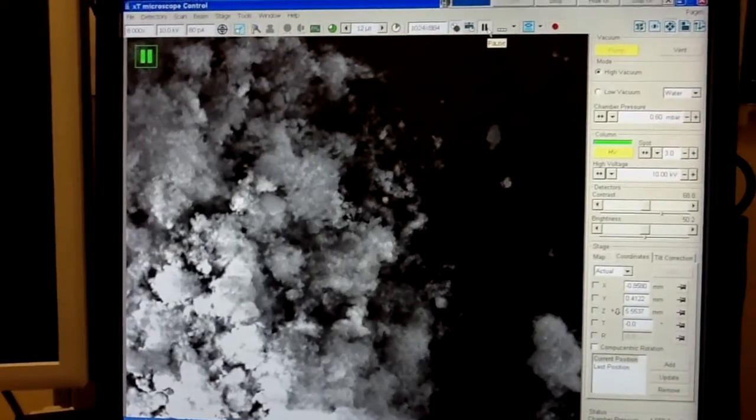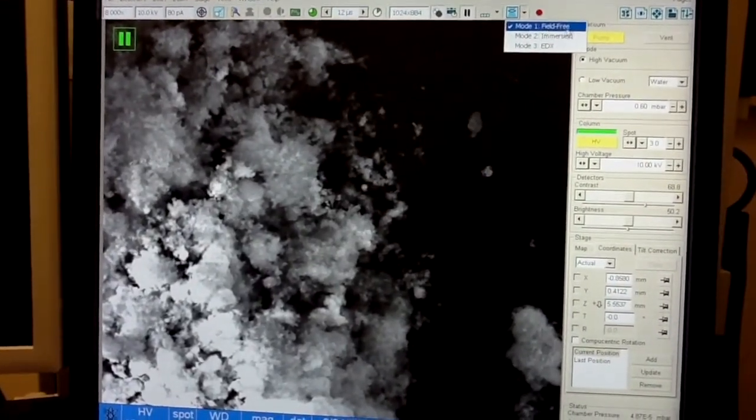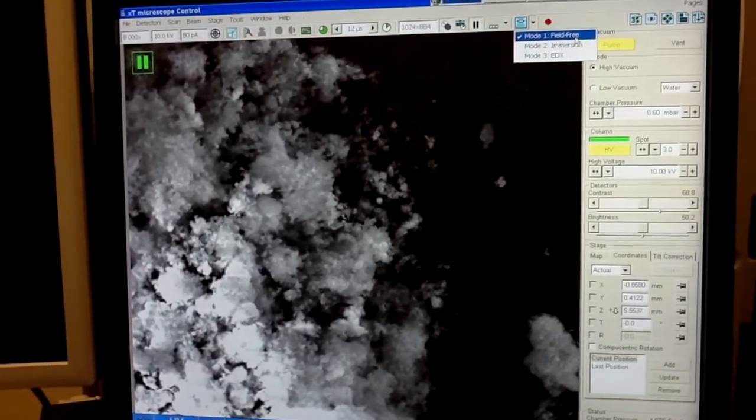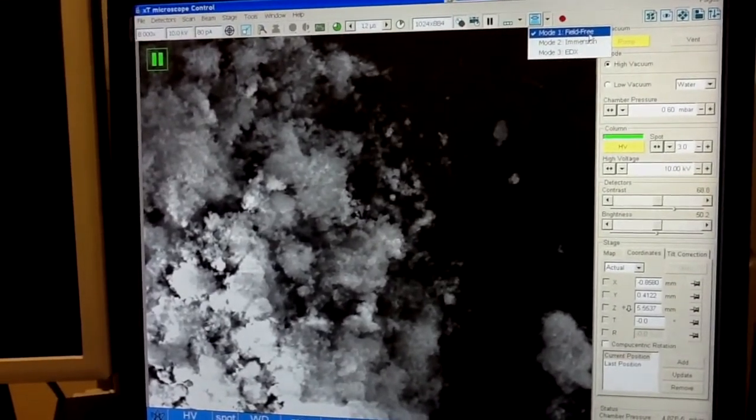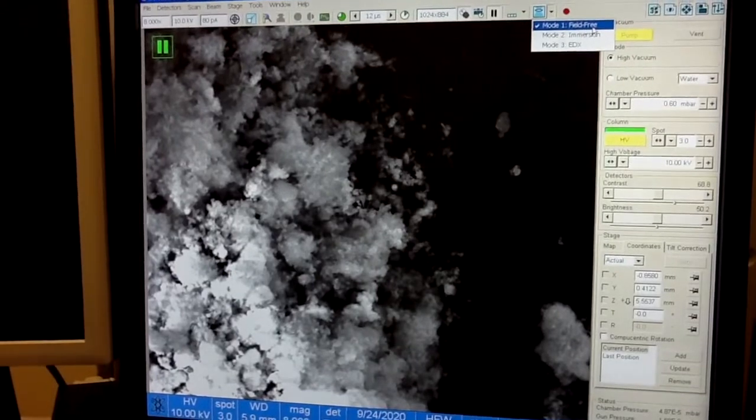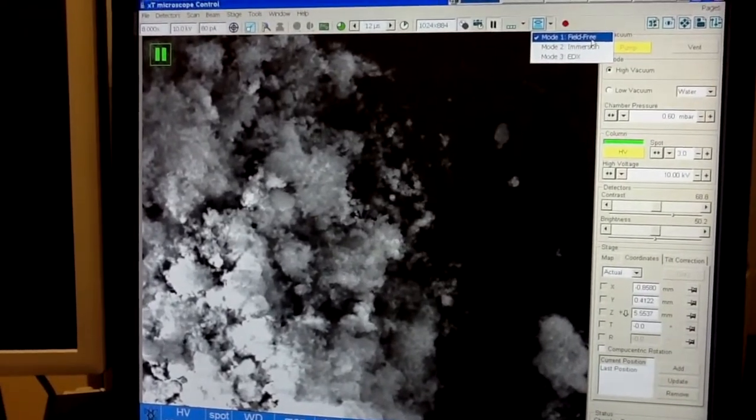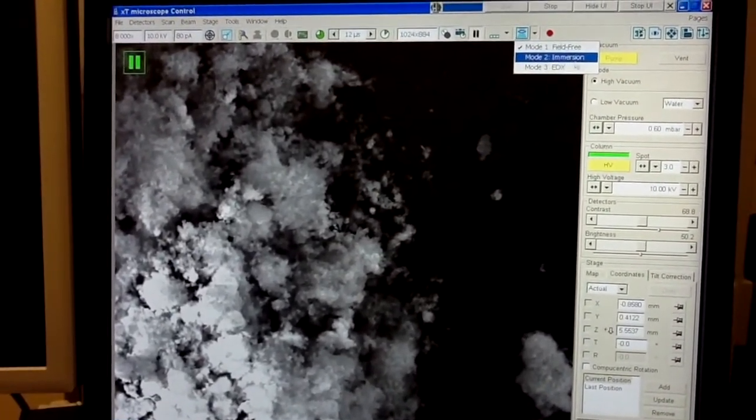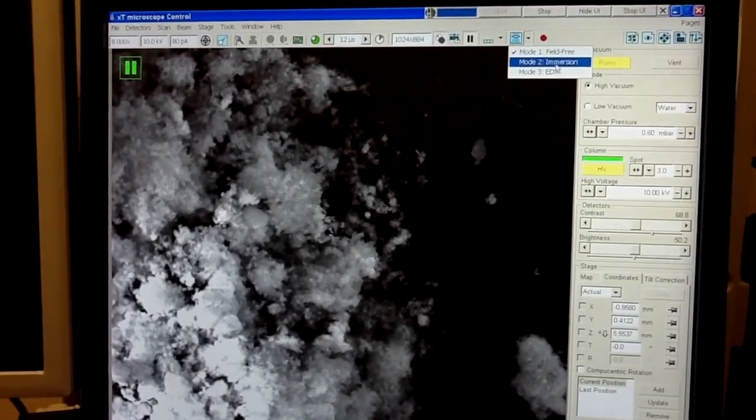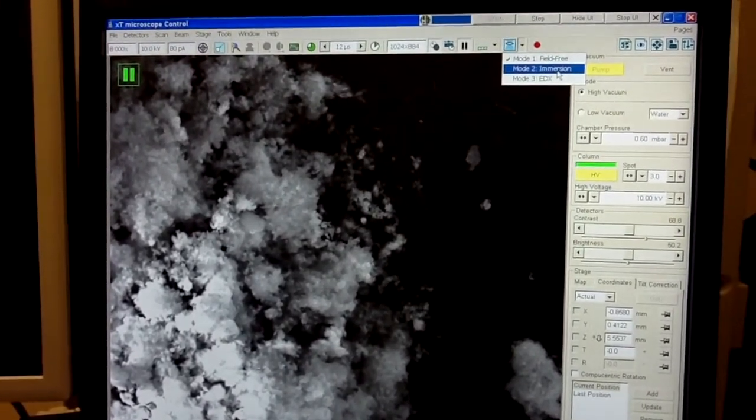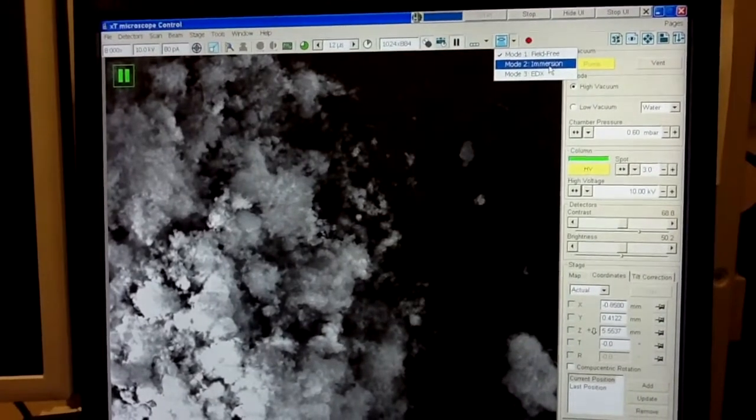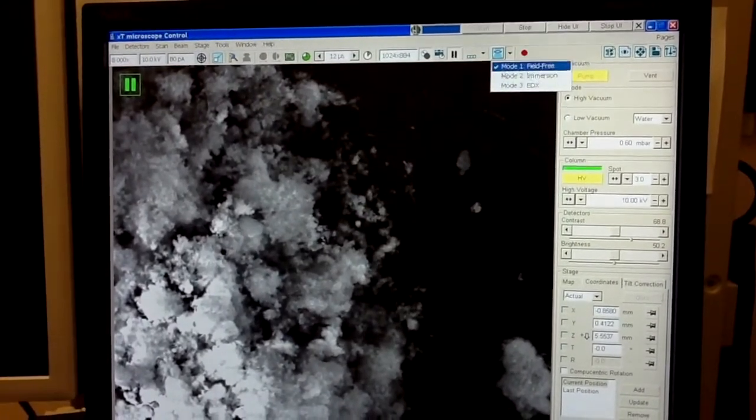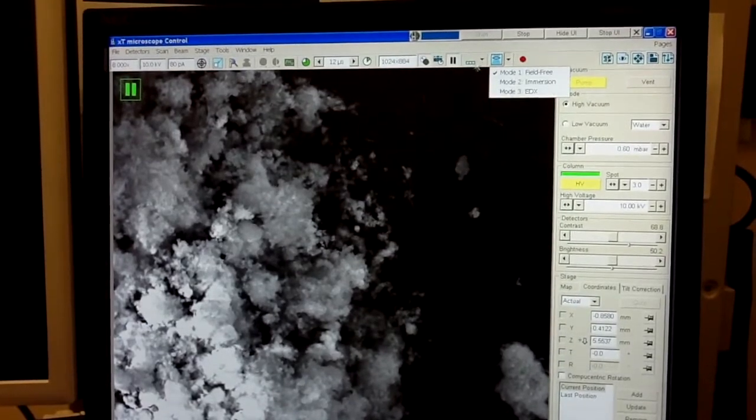This is so-called field-free mode, or low magnification mode. And for most applications, it will be sufficient. However, if you have very tiny details, very small features, you may want to use immersion mode, which will allow you to take images at very high magnifications, let's say 100,000x or even higher. I will now show you how to do this, how to use this immersion mode.